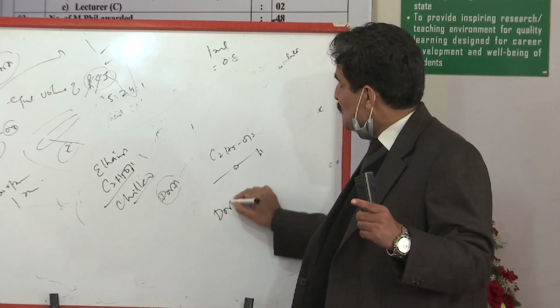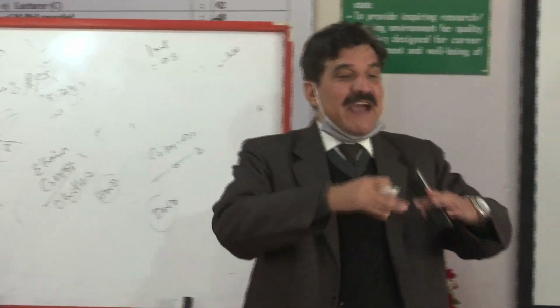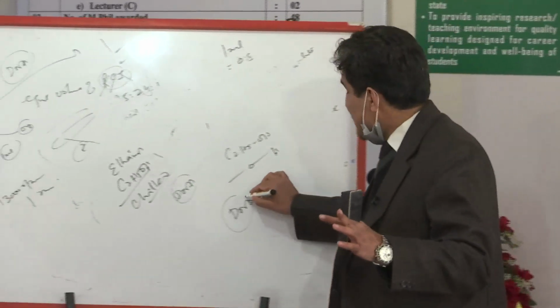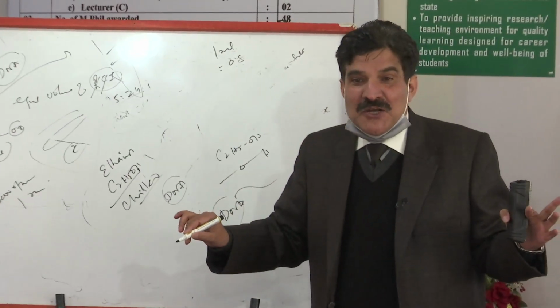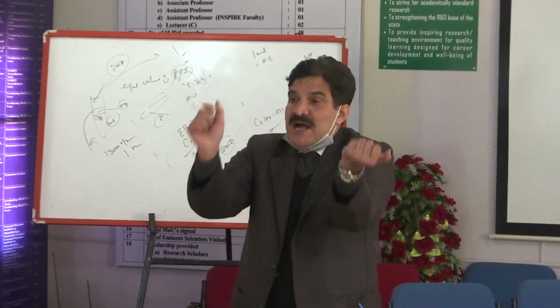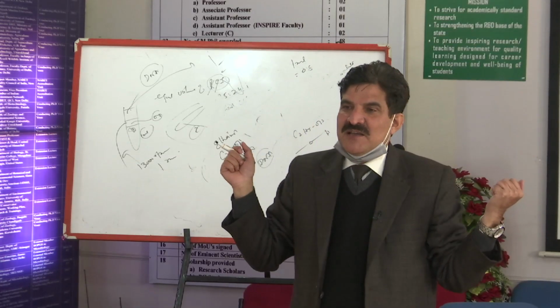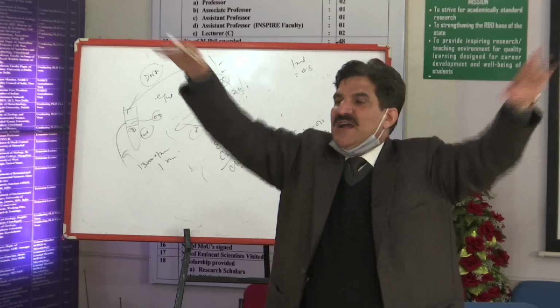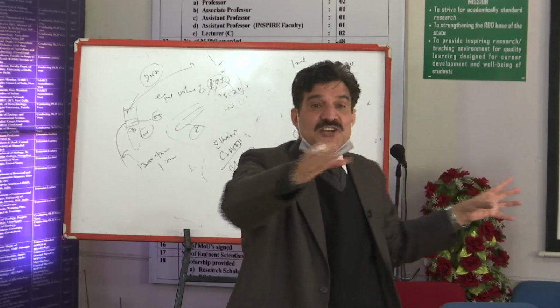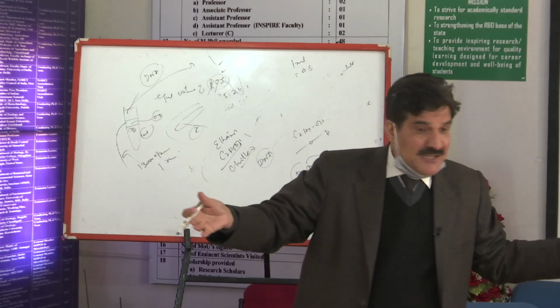DNA is soluble because of the water available to it within the system, too much solubility. And when you try to abstract water from DNA, what happens? You must know that in the DNA structure, the hydrophobic bases are interior. Only the negative phosphate groups are outside the system. These negative phosphate groups interact with water through hydrogen bonding, and solubility is maintained.